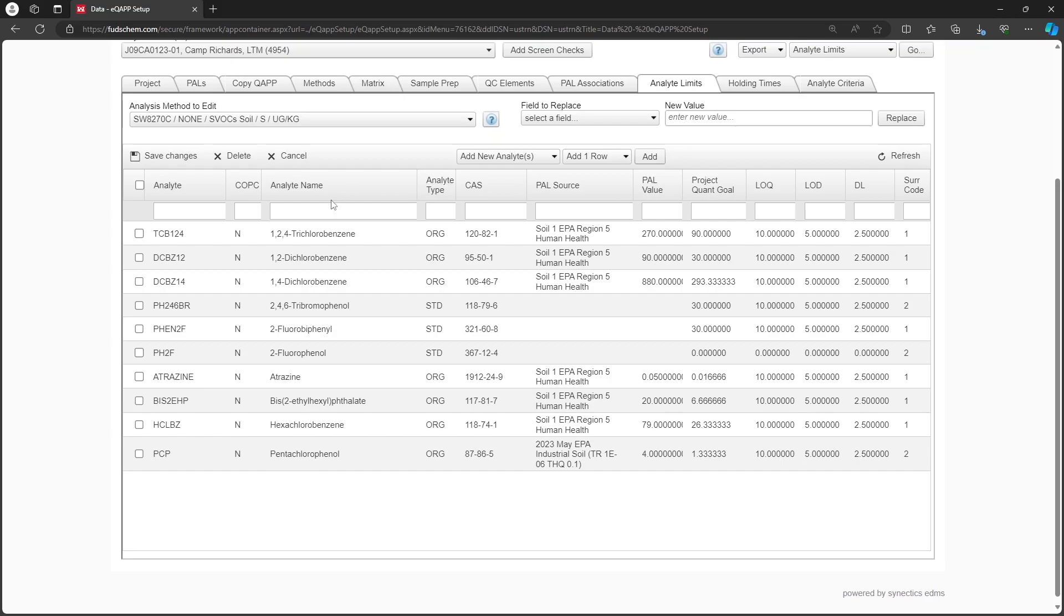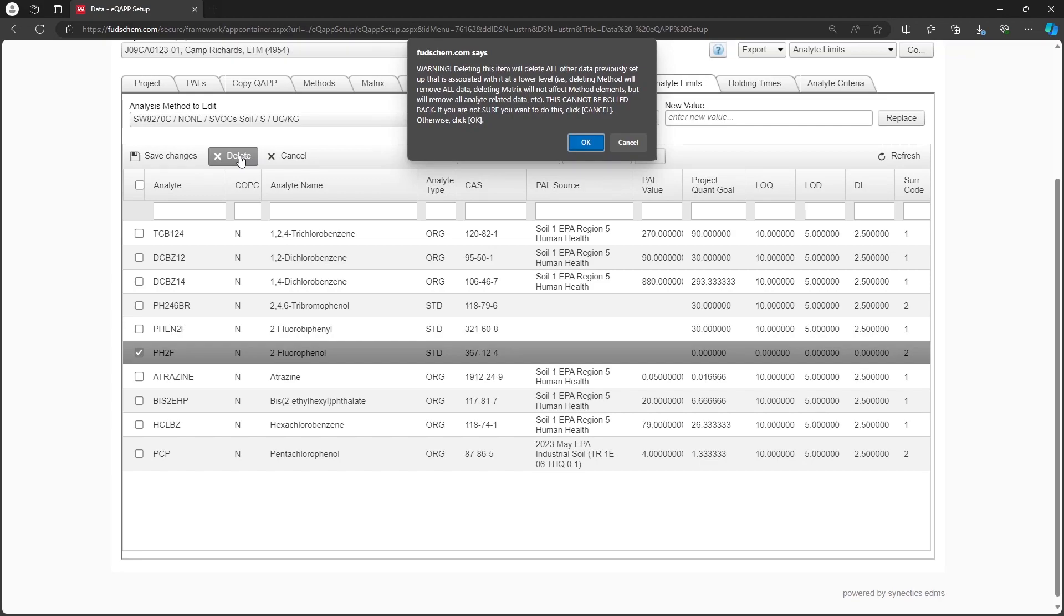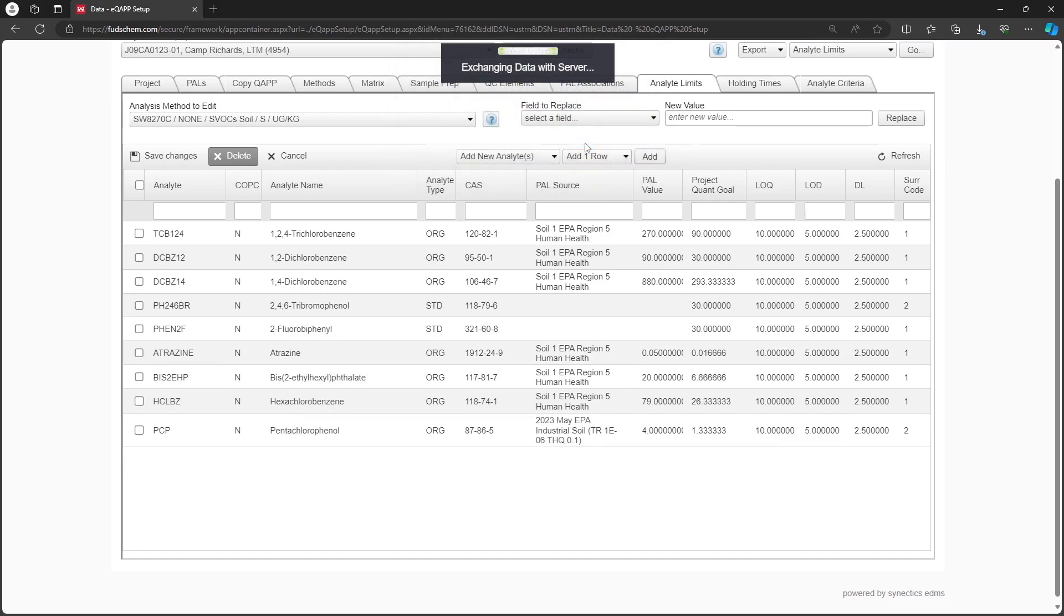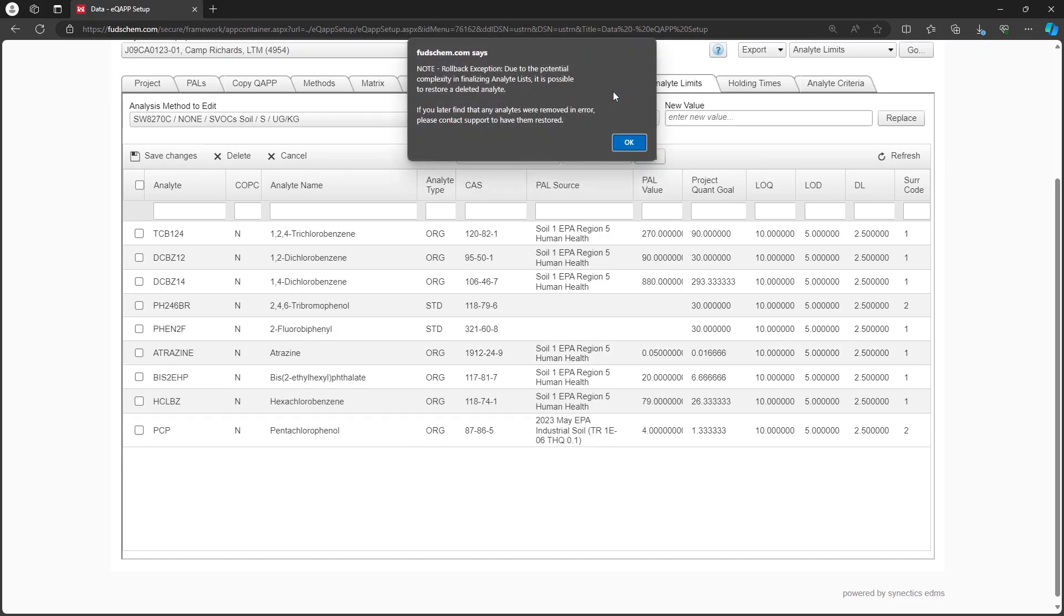First, let's delete any analytes that we don't need. Check the boxes next to the unneeded analytes, then click Delete. Note that in other tabs of the EQAP, deletion is permanent. However, if you delete an analyte by mistake on this tab, you can contact support for help restoring it.